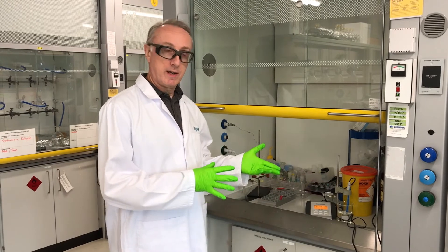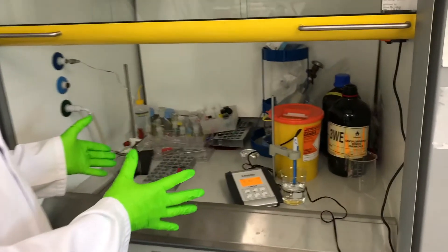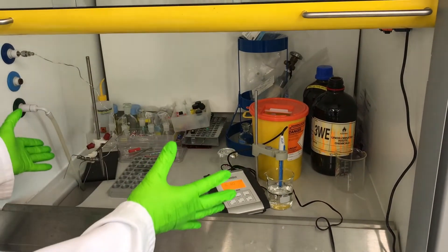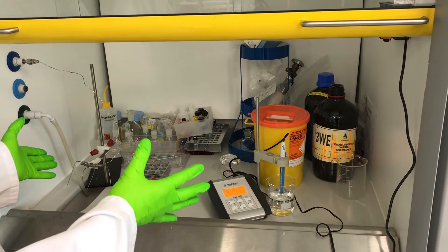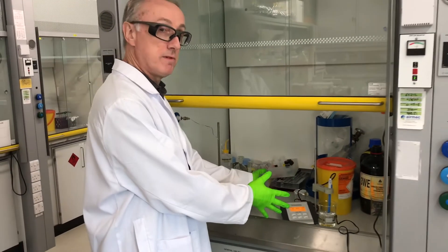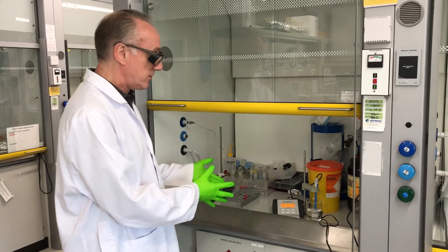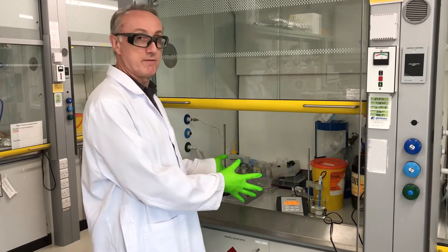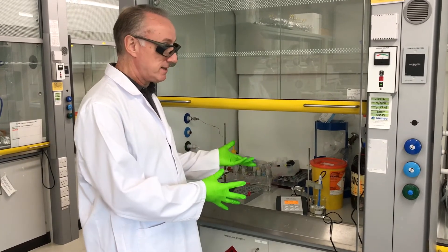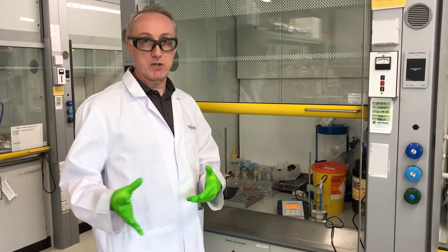So here we have a set up in a cabinet. This is a classic set up. The cabinet is already full of stuff and you don't have a lot of room to work. So we put what is actually a small bench meter in the cabinet so you can see the effect of this lack of space. It would be much better if we could have an alternative way of doing things, so I'm going to show you that now.